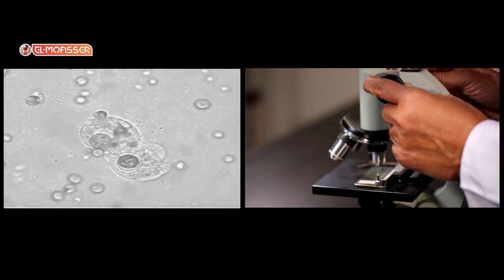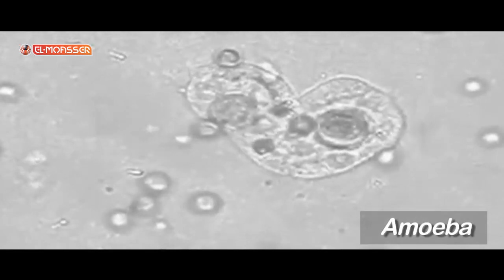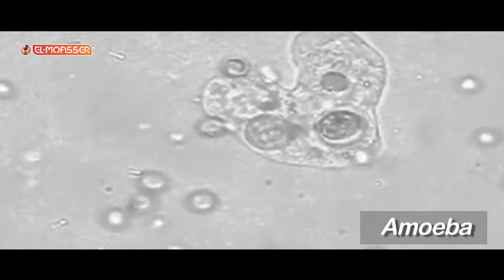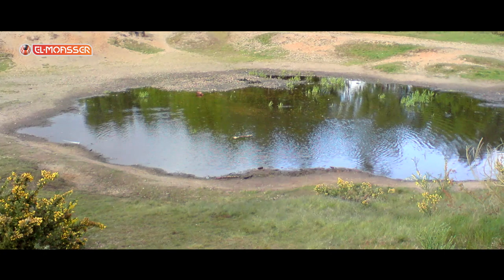are some cells that move by pseudopodia and others that move by cilia. The cells that move by pseudopodia are amoeba, and they live in ponds.